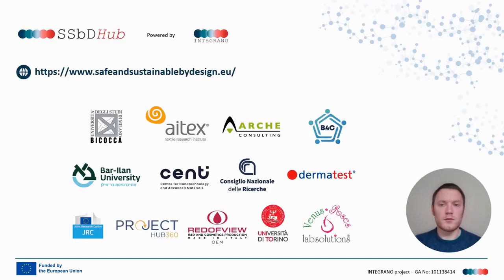So in conclusion, we have developed a very useful tool for the management of data within the INTEGRANO project. But the great thing about the software is that it is readily customizable. So we can adapt it for use in virtually any other project funded by the EU and elsewhere. So the software therefore offers a new holistic approach to data management whilst offering enhanced functionality for the management of project logistics.